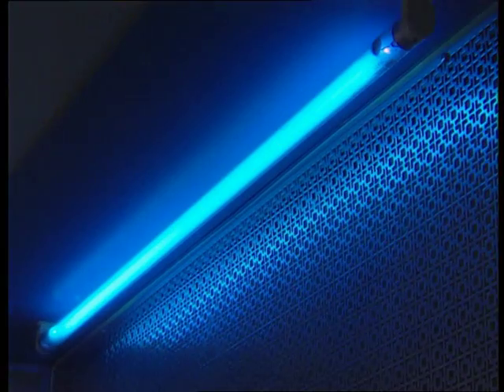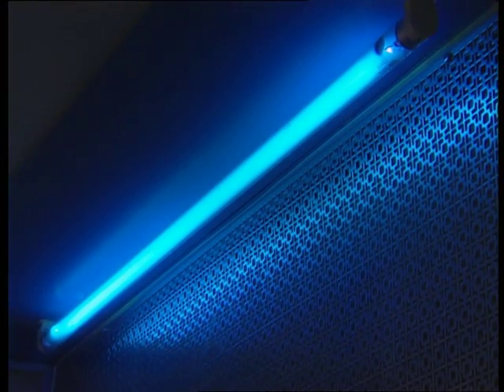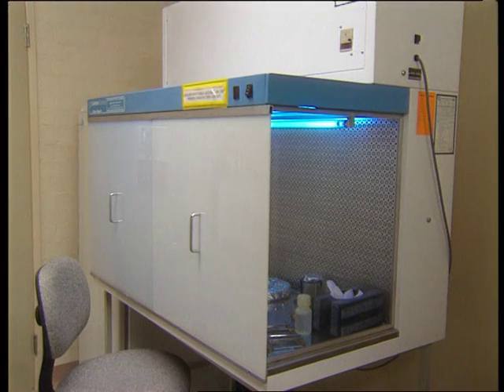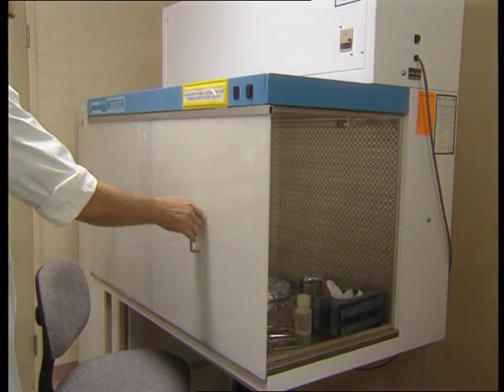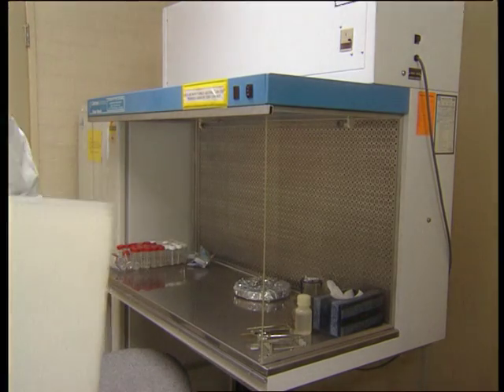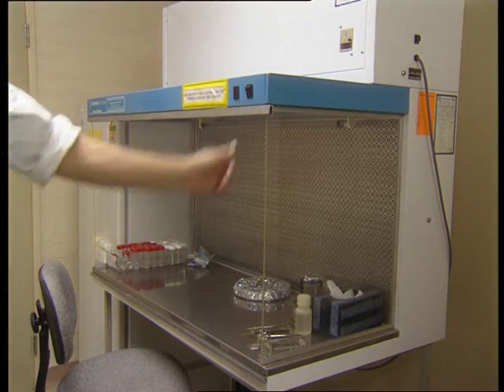The laminar flow cabinets are also fitted with a UV light, which can be used prior to the time one needs to use the cabinet. UV light is a germicide. It also causes skin cancer and affects the retina in our eyes, so it must only be switched on when the shield is in place. The UV light must be turned off prior to the removal of the shield, and then the motor which draws the air must begin to operate.